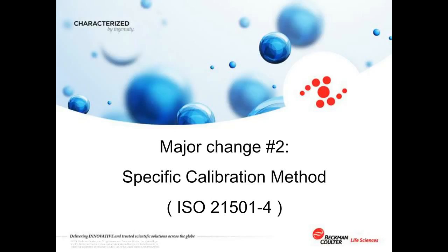Well, a standard ideally should be very consistent. We should find the same results based on the method and the instruments used, so that it, in a sense, gives us reliable and consistent information as a standard. So the committee adopted the known and specific method, 21501-4, and again, this has been around since 2007. So it's new in 14644, but not a new method.